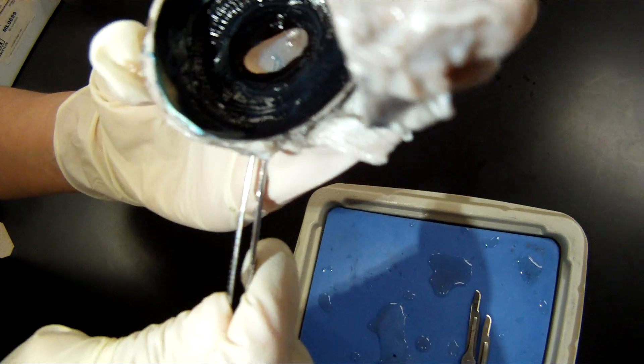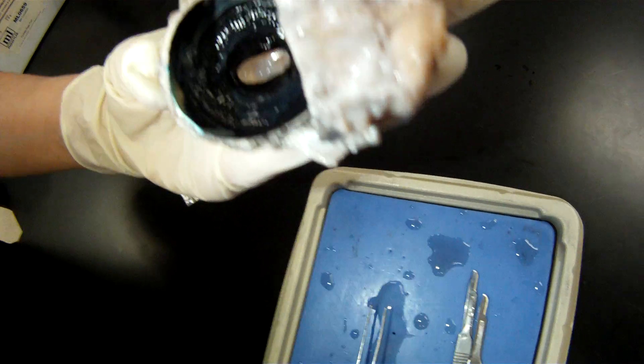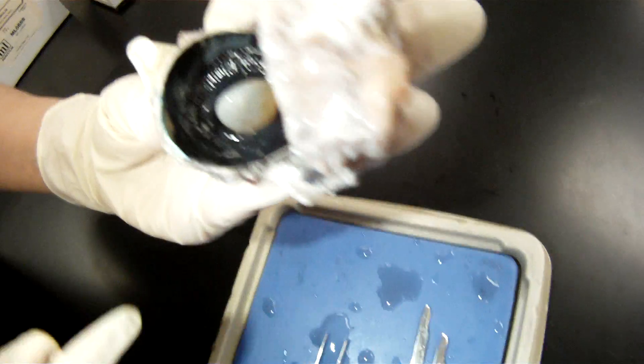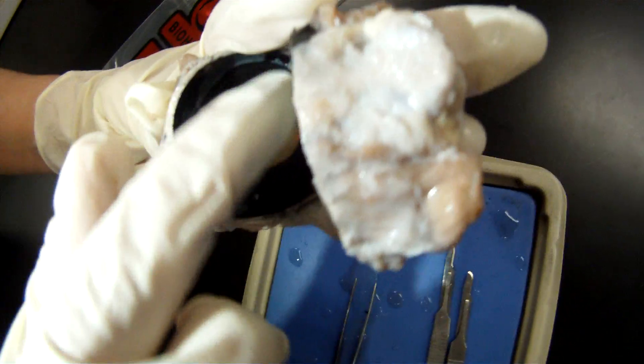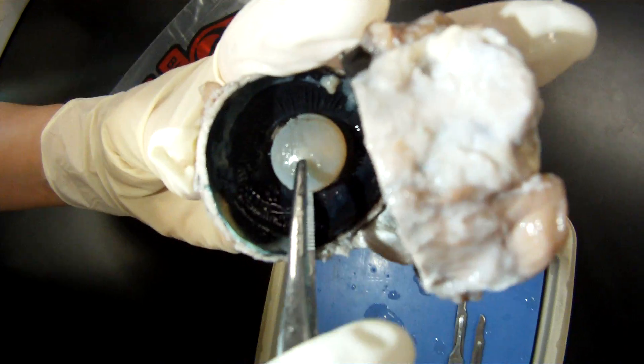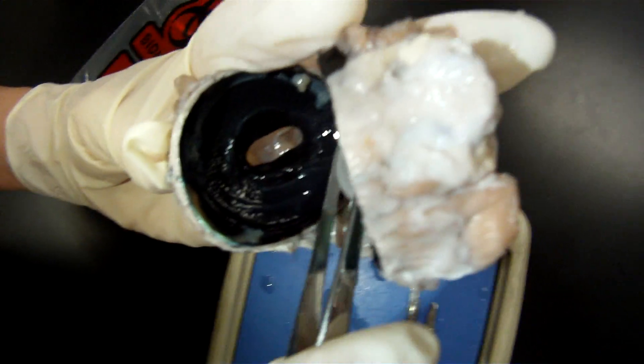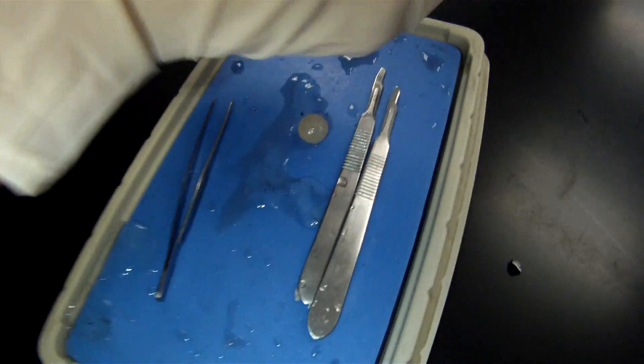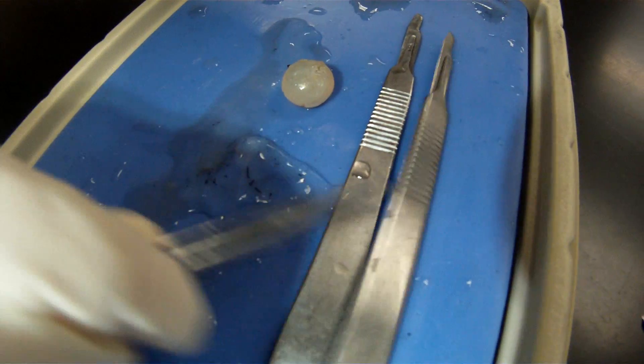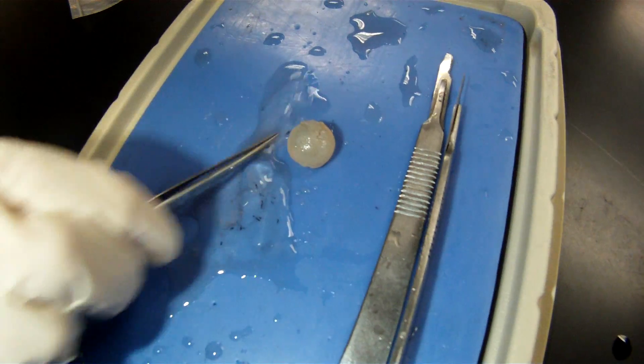We also took out the vitreous humor contained in the posterior chamber. It fell out. There's our lens, right there. It was attached to suspensory ligaments, which was attached to the ciliary body. We had to break those to get it out. This was our vitreous humor down here.